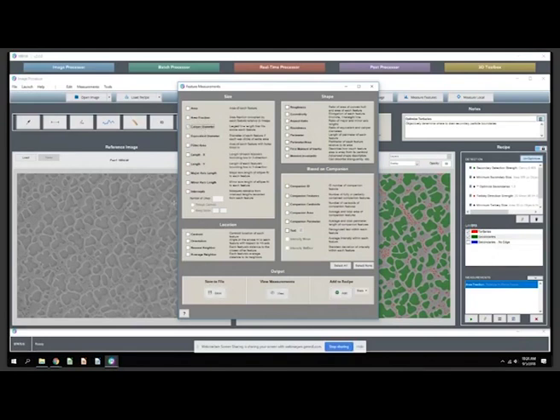That's one way of measuring size, the longest line that fits inside of the object. We could also look for proximity at average neighbor distance, which was of interest to NASA. This is a way of looking at particle spacing, and is a new metric that was added in 2.0. And then let's also take a look at eccentricity, which is somewhat of a normalized aspect ratio.